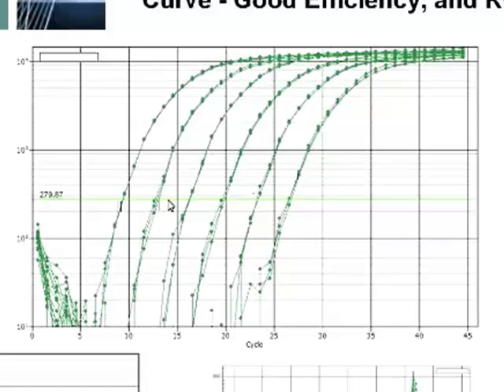Okay, and be very careful with your pipetting. If your primers are sort of medium expressors, they come up between around 18 and 25 CTs, I would recommend doing a 4-fold serial dilution series.